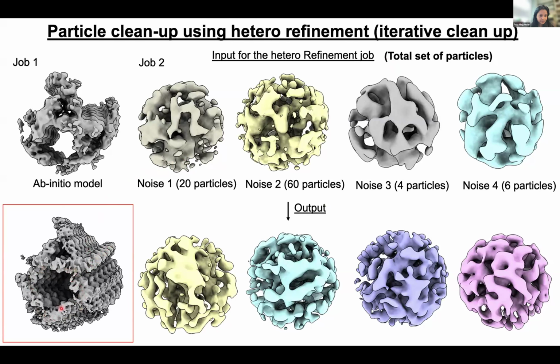So the time scale, when we increase the time scale more than 10 seconds, this is what happens. It forms a very thick sample. But the exact time frame, how it progresses to form this kind of network, for that we are trying cryo-ET to understand in vivo how this filament assembly is forming and also the disassembly, but we are still trying that. But at this point, we just know that it forms within seconds.